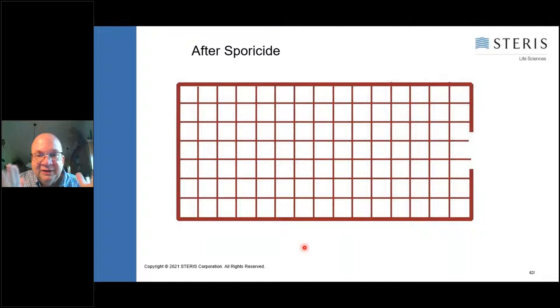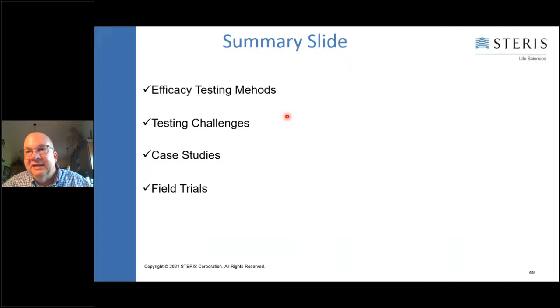So to summarize what myself and my colleague Dan Klein talked to you about today in the webinar, we talked about efficacy testing methodologies and requirements in the industry. I talked a little bit about what the FDA and European regulators expect, as well as regulations and guidance documents in the industry. My colleague Dan talked about testing challenges and did a very nice deep dive into what all those challenges may be and how to overcome some of them. I talked about some of the case studies at different pharma sites and biotech sites. And then finally, I finished off with field trials and how to conduct those.